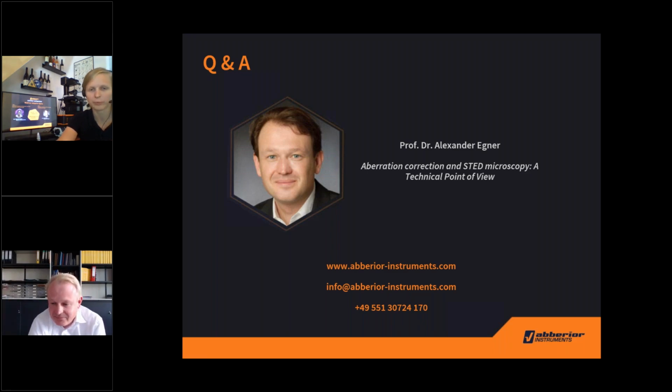Good point. All right, final question for you, Alex. How is the day-to-day stability of the deformable mirror used? Yeah, so the one we use is very fine. We just installed it one time. Then, of course, we had to calibrate it, and then we haven't recalibrated the whole system for the last 4 years. So from my experience, it's really, really solid. You just have to install it, and that's it.